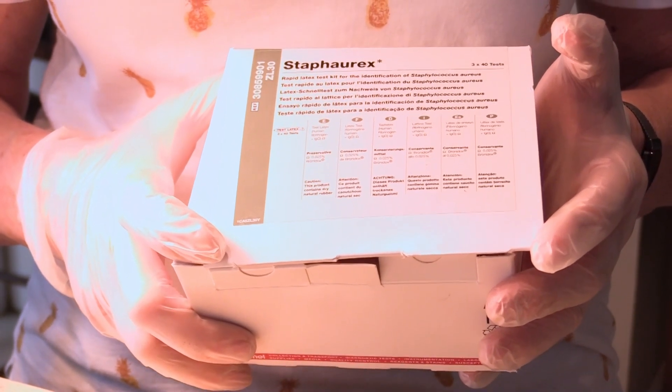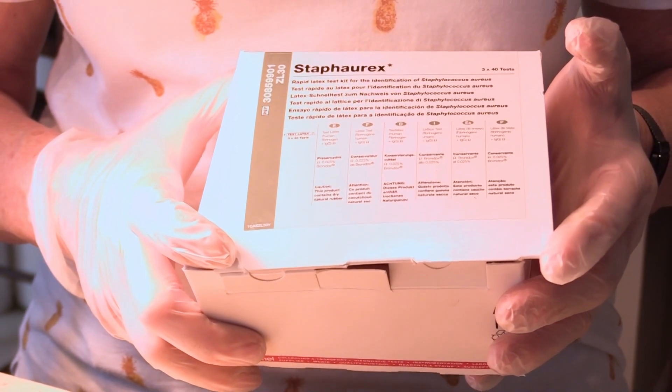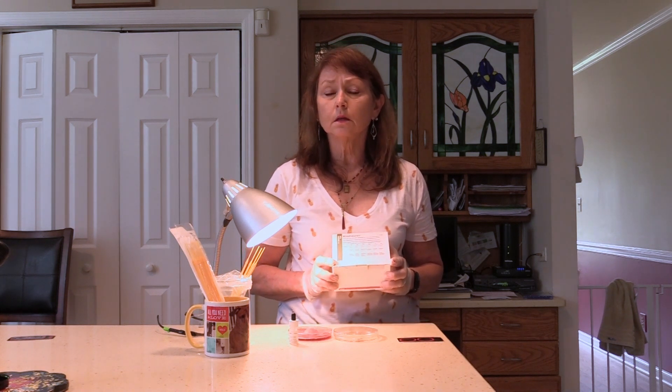Let's say we've collected a sample from a patient — maybe a wound sample — and we've identified the genus Staphylococcus. We do a gram stain and can observe gram-positive cocci in clusters. We've done biochemical tests to determine that it's a halophile and it's catalase positive. So now I'd like to know: is it Staph aureus or Staph epidermidis? I cannot tell that by looking at it under a microscope.